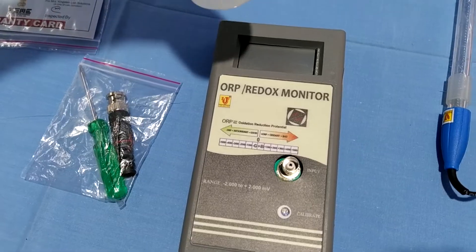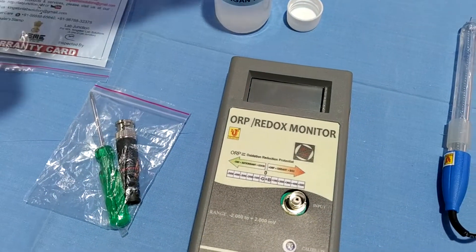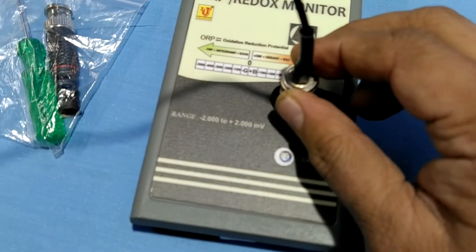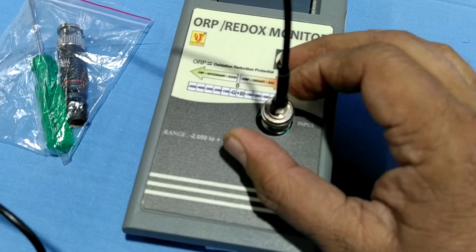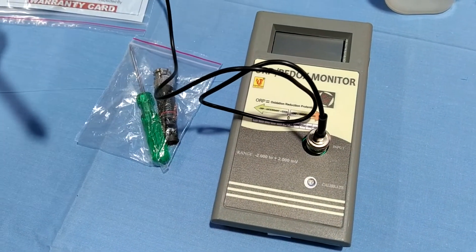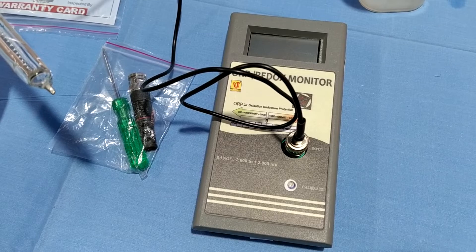This is one sample of Kangan water, and this is hard water. You have to install the ORP electrode to the instrument. We provide a factory-calibrated ORP Redox Monitor — no need to calibrate. Directly plug and play.